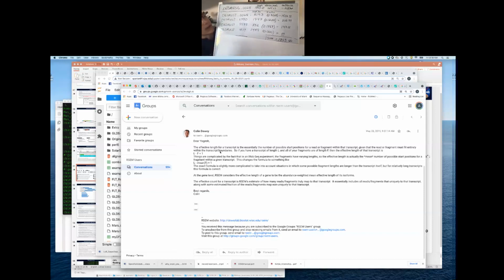And so when you go to calculate this length for the gene, it's based on how that gene is expressed in the data that we gave. And so this isn't necessarily only the longest transcript, because other transcripts of that gene could be expressed. And that's the case that we have here. So this is looking at expression of this gene for the sample. And so what we see here is that if you look at the isoform percentage, it's a weighted average.